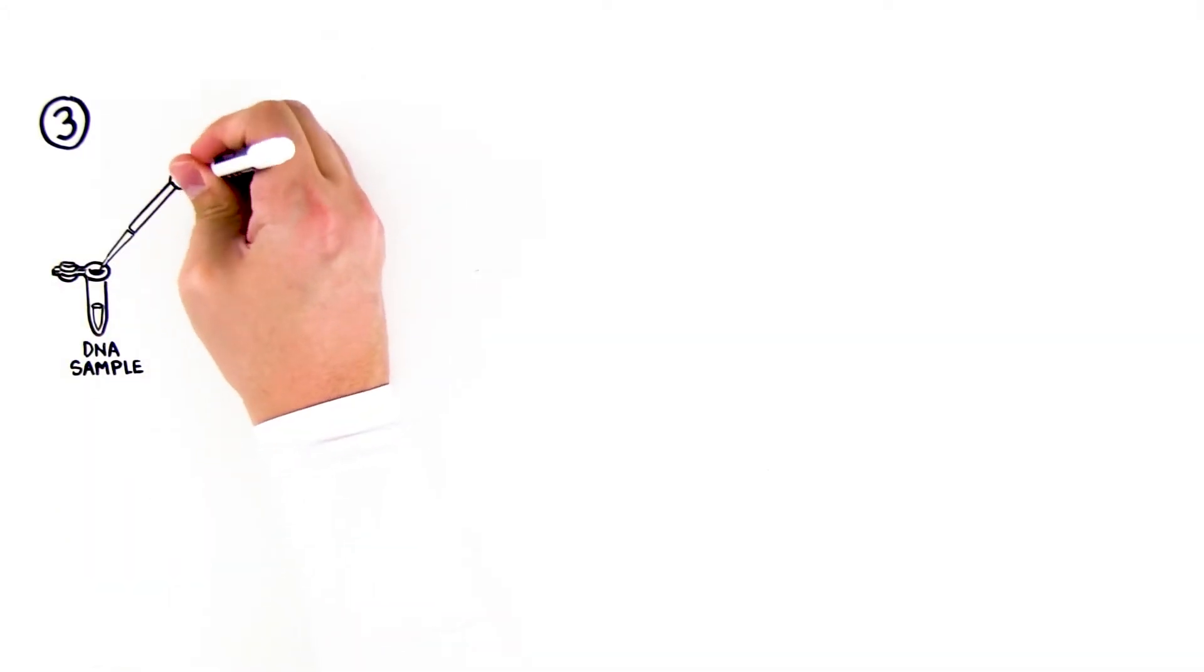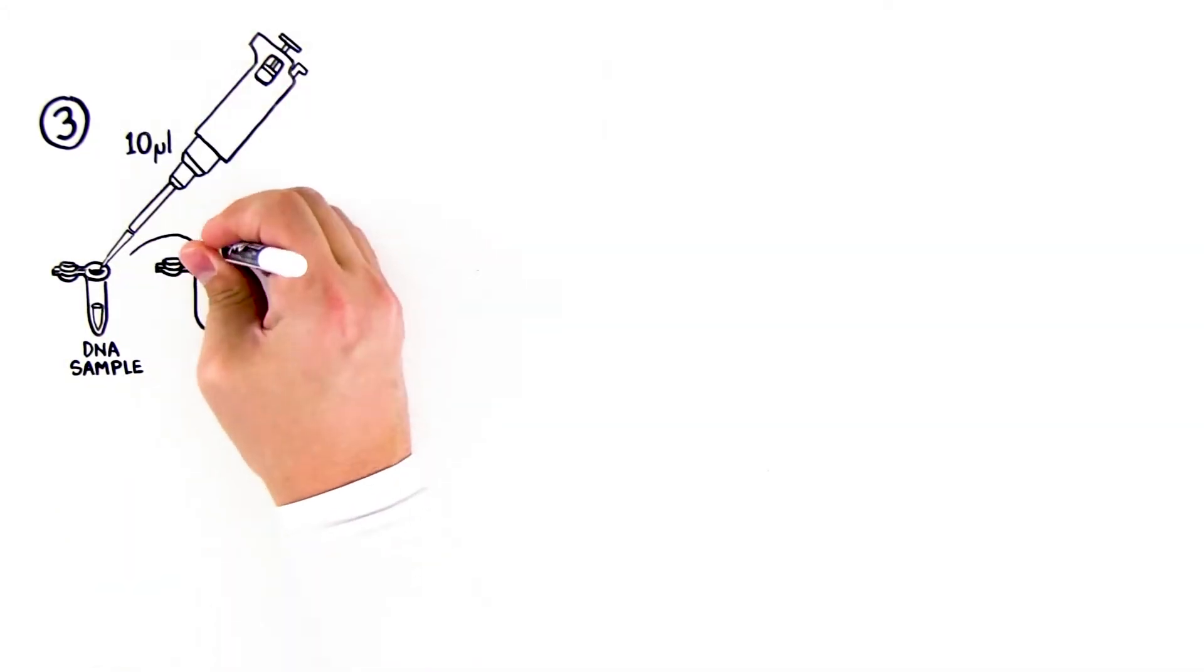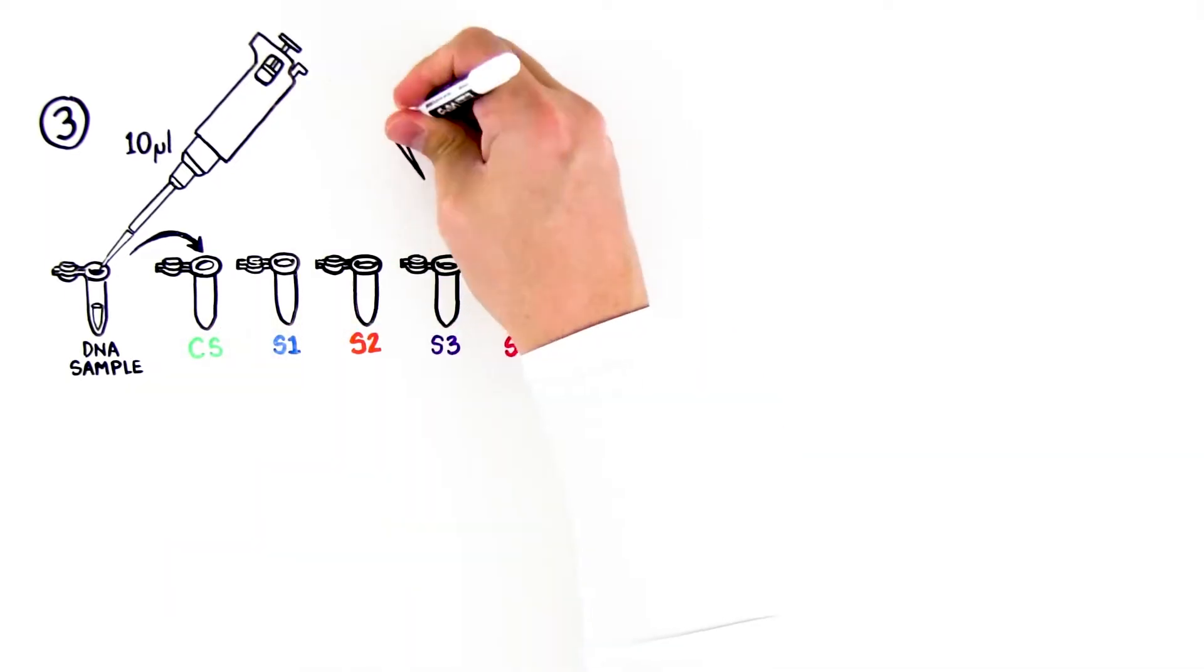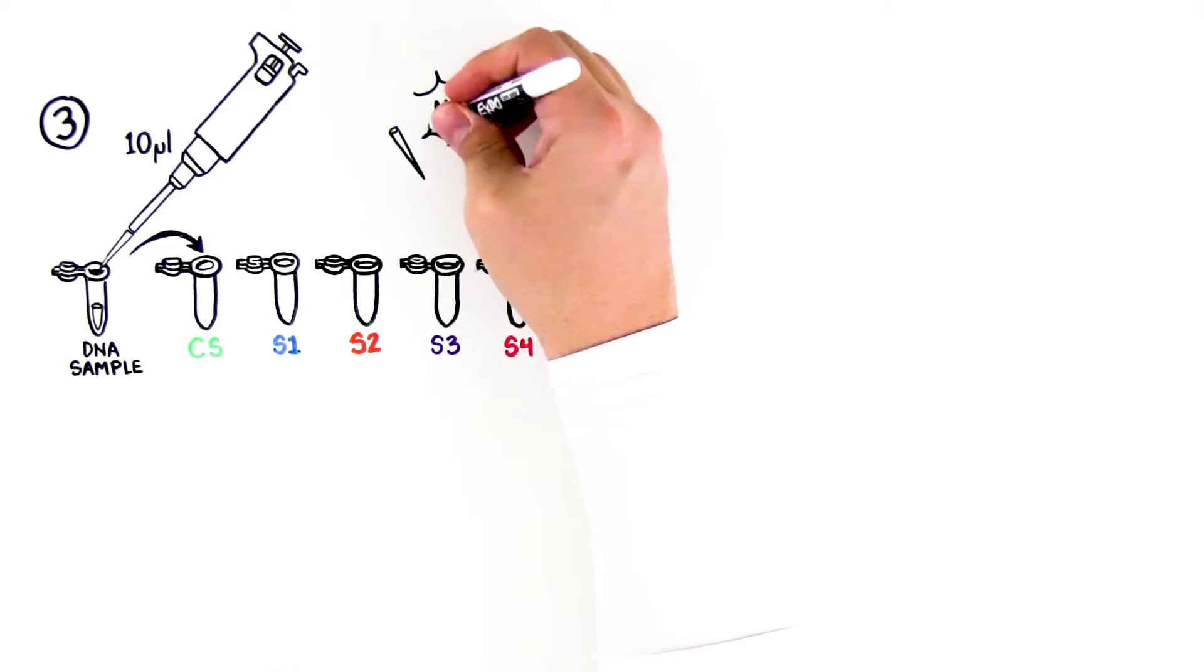Third, pipet 10 microliters of each DNA sample from the stock tubes and transfer to the corresponding colored microtubes. Use a new tip for each DNA sample. Make sure the sample is transferred to the bottom of the tubes.